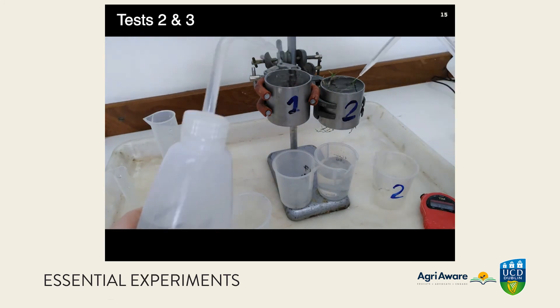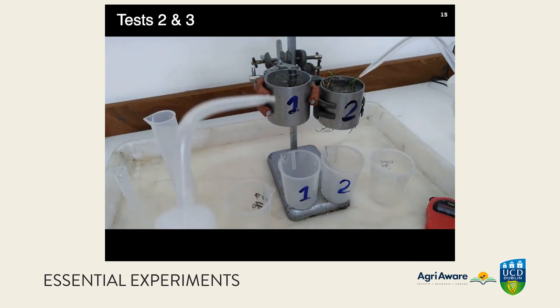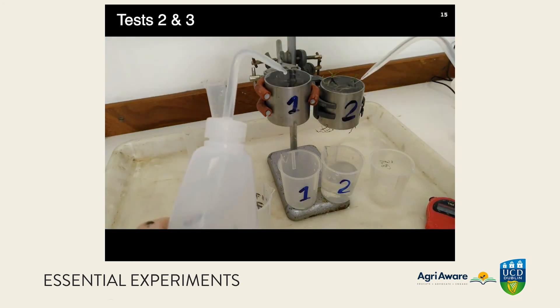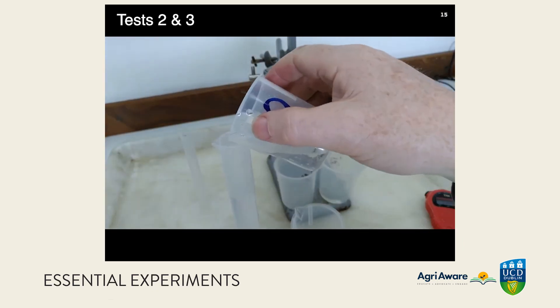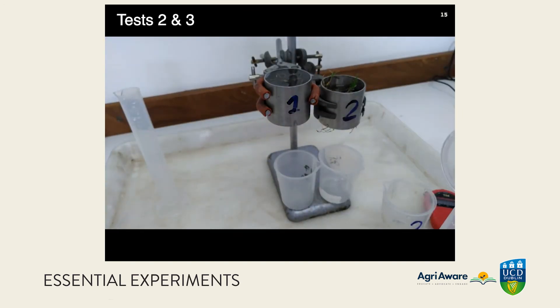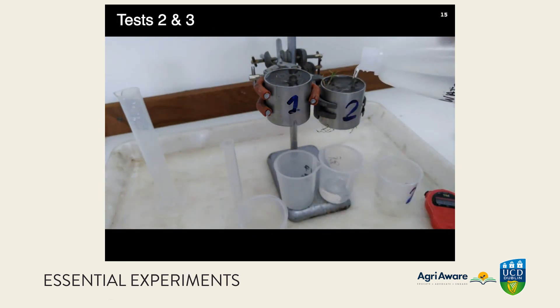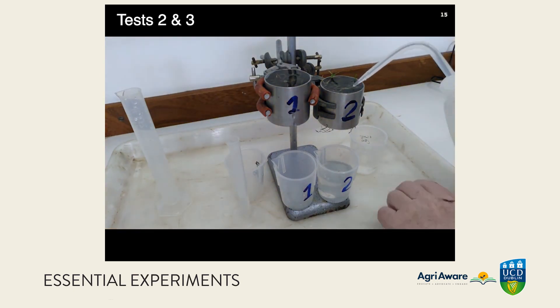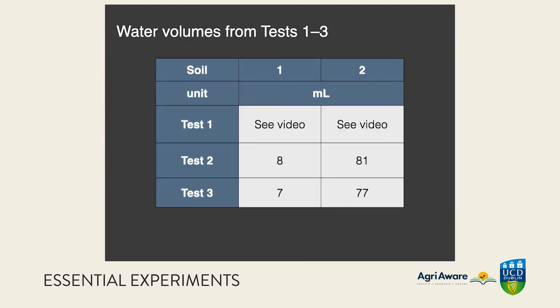Tests two and three proceed rapidly. We don't need to sit around watching them all day. The same process is carried out with the same imprecisions in swapping the beakers and keeping the water level constant. We could probably do a somewhat better test by holding these conditions more constant, but doing it three times at least helps get things right — we can take the mean of the three tests. Results are very consistent: the water flow is similarly different between the two samples, so hydraulic conductivity is fairly constant even though a lot of water has gone through the soil — it's not changing over time.